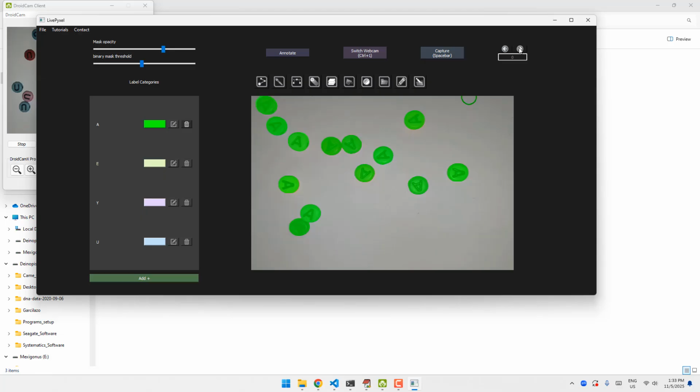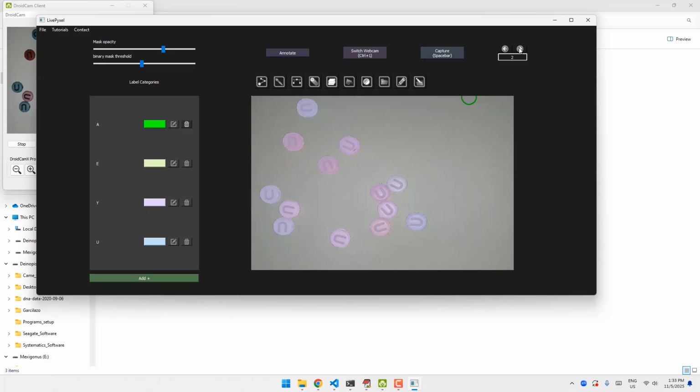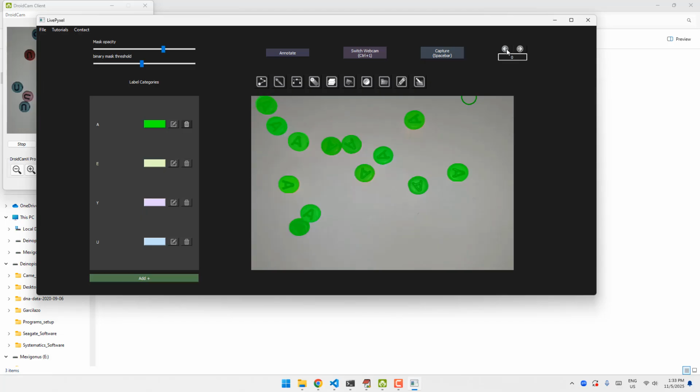As you can see, the process of completing each of the annotations has been dramatically reduced because we don't have to label each of these manually using polygon tools. This is even faster than some integrations using the Segment Anything Model, because it allows us to complete every single object in one single go.